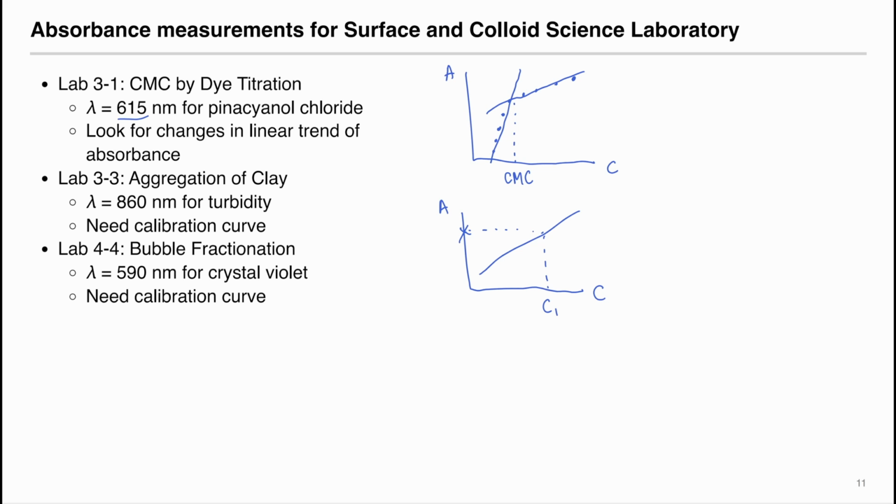In this video, we looked at the theory and practical aspects of making absorbance measurements in a microplate reader, and this can be applied to at least 3 labs in the surface and colloid science laboratory.